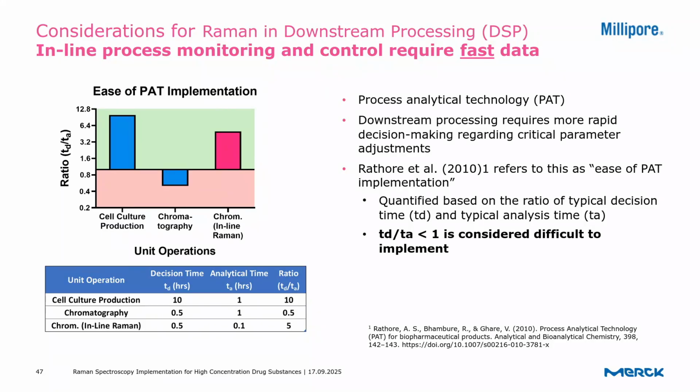On the other hand, downstream purification of biologics involves operations that experience process changes much more rapidly, especially at smaller process development scales. This makes inline PAT implementation much more difficult due to the requirement for rapid measurement times.